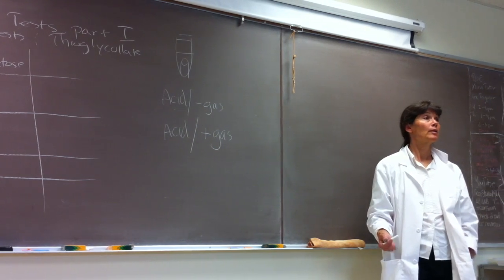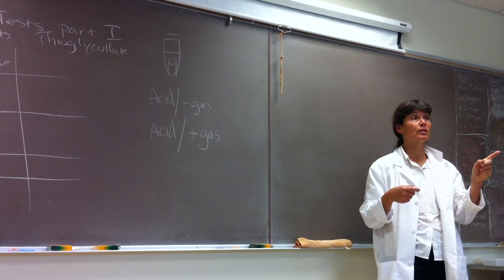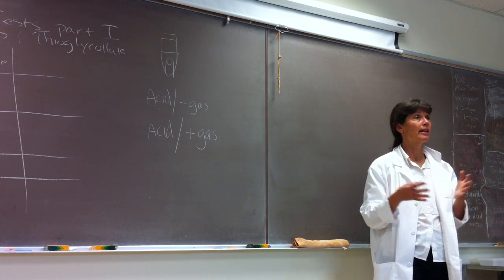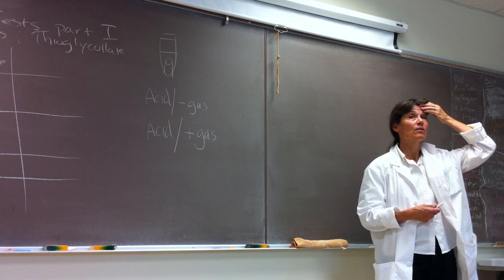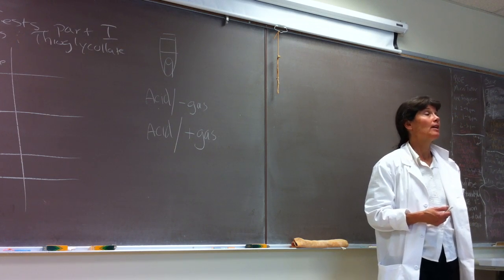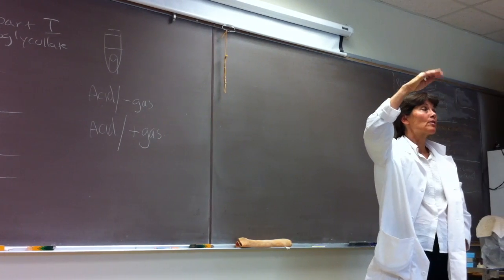And what happens when our microbes tear apart the amino acids? When they release the amino group, it gets released as ammonia, right? And ammonia can bind hydrogen ions and cause what to the pH? Increase. Increases, right? What color does phenol red turn under alkaline pH? Red. Red, okay? So if your tubes are red, gently shake them, you guys, to make sure the cells grew.